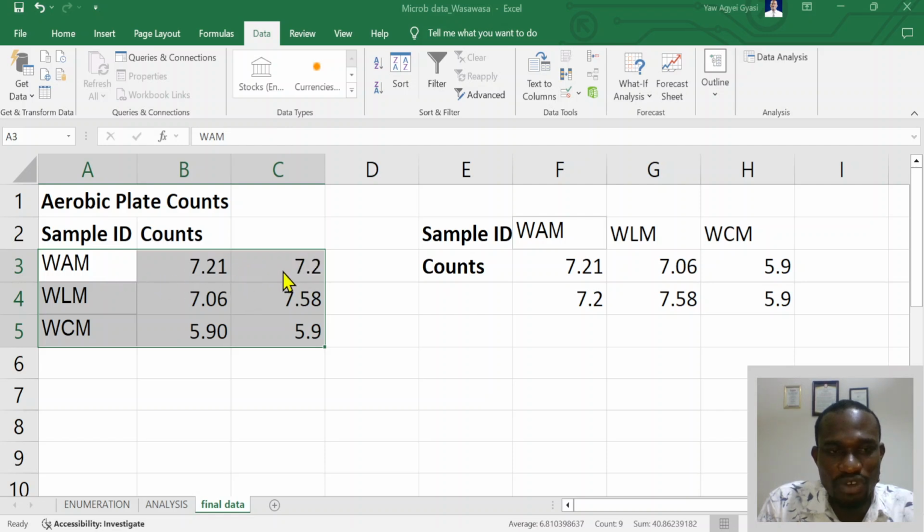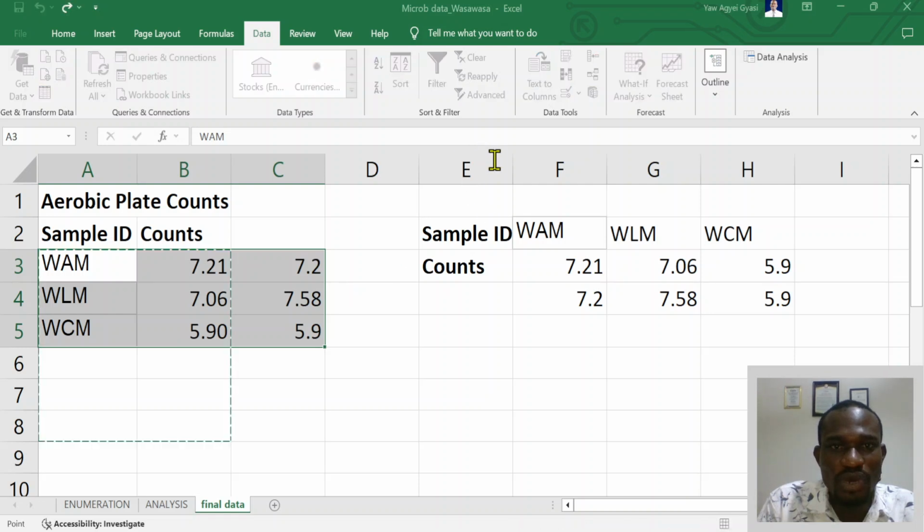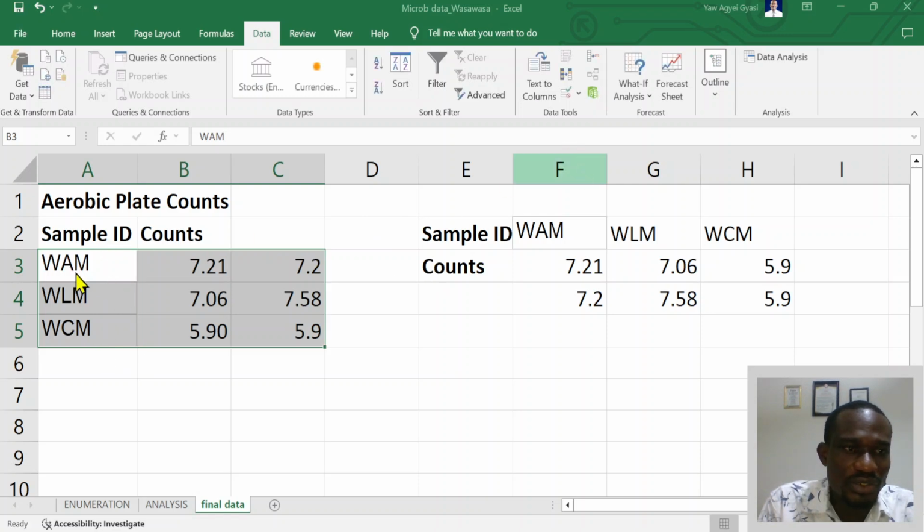And as I mentioned, this has been arranged in the row. The inputs, that's the numeric values, are in the row format. And so I'm going to make sure that that has been selected. And once you select the rows, it means that your labels would have to be in the column. So the labels are the titles. These are my labels. The labels are in the first column. So let me select the labels so that it will recognize the labels as well. Okay, and my labels are in the first column.